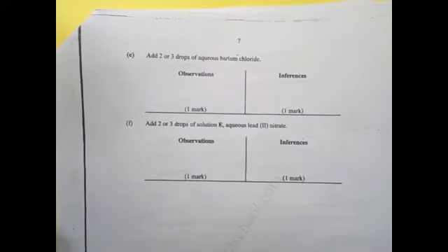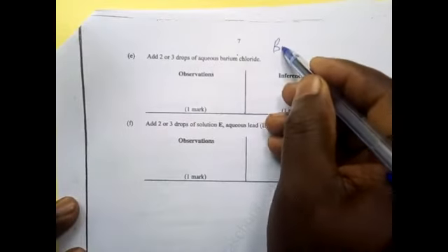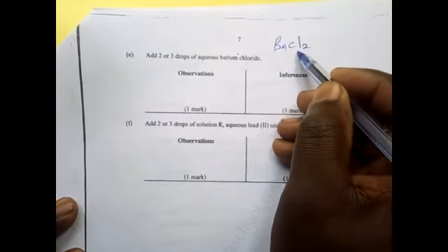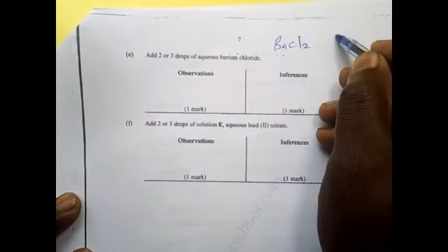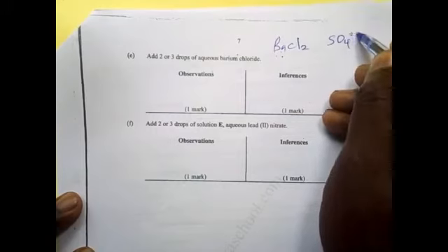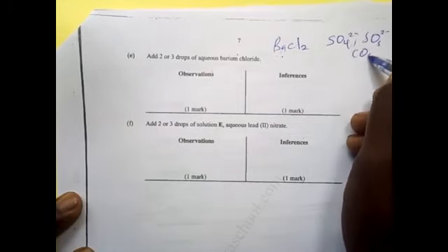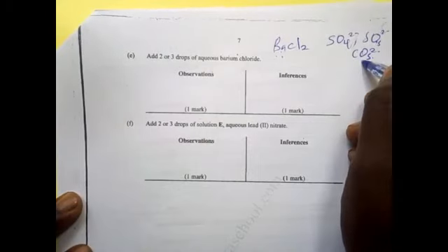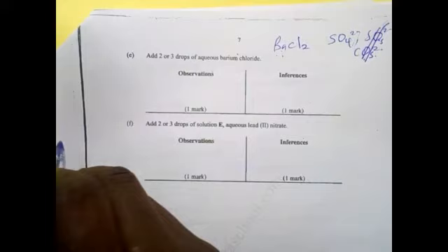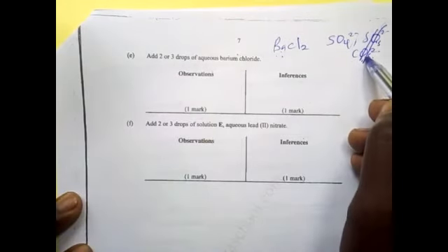Add 2 to 3 drops of aqueous barium chloride. Barium chloride will form a white precipitate with the sulfate, with the sulfite, and with the carbonate. But we have said the sulfite and the carbonate are not there from the previous test.